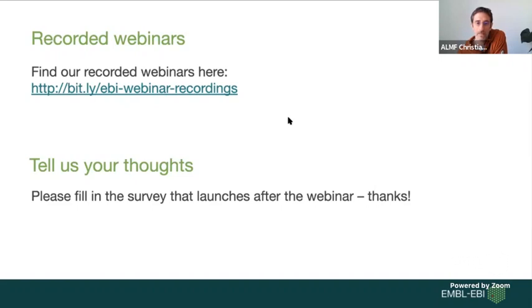Then here, Niels. Are there agreed upon thresholds when an object segmentation should be considered a true positive, or is it recommended to show precision and recall over a range? I think the second. So there's just no standard way of setting a threshold. I think you have to do the precision and recall. Yes.